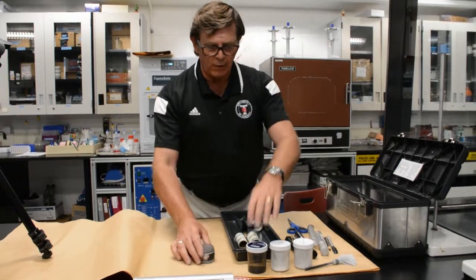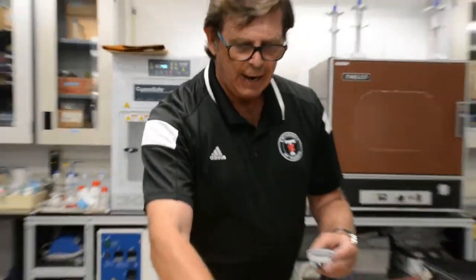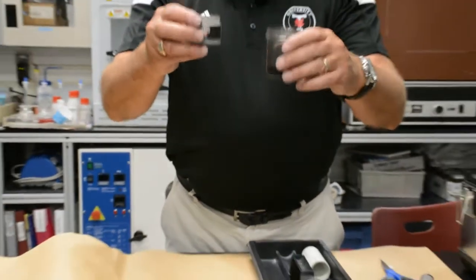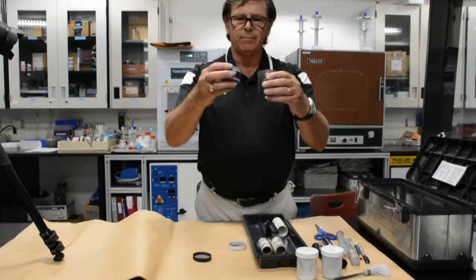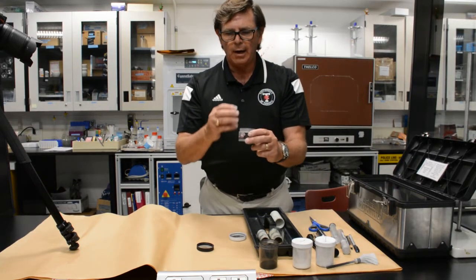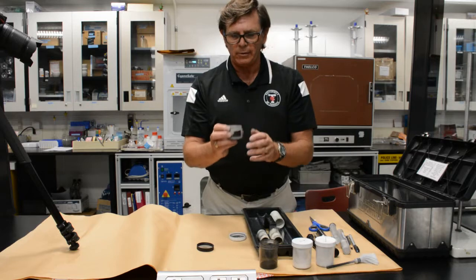So the differences here between the granular fingerprint powder, which uses the fiberglass filament brushes, and the magnetic fingerprint powder, you can see, is first off, there's a considerable difference of weight per volume of the powder. Because the magnetic fingerprint powder, which is generally in a smaller jar, has iron filings, and it's a commercially made product, so the iron filings are within the powder itself.